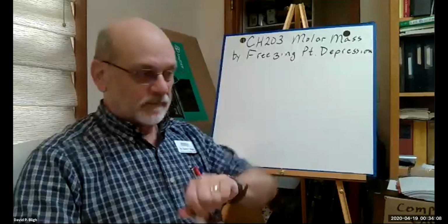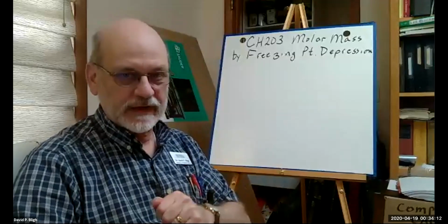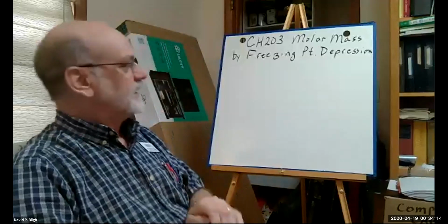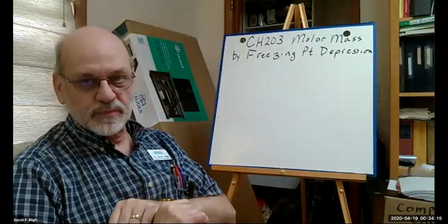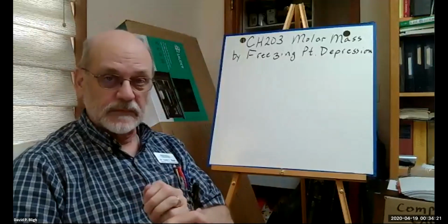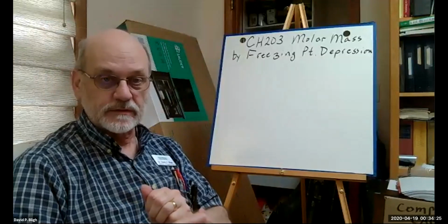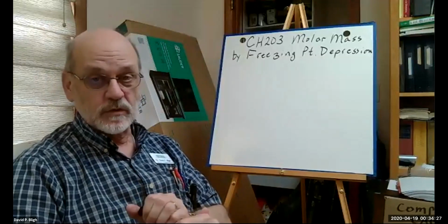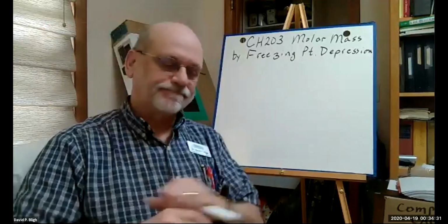All right. This is my second attempt at recording an acceptable product. We're going to present, or I'm going to present, the introduction and materials for this lab for CH203, molar mass by freezing point depression.